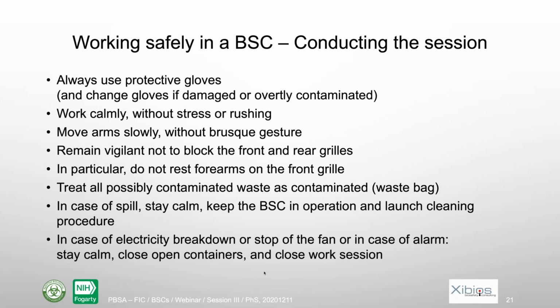Also, in case of spill, I mean, biosafety cabinets are there to protect us from aerosols during normal operation, but also in case of spill. So if there is a spill, the first thing to do is to keep the biosafety cabinet working. It should keep working. It's there to protect you in that case. And then stay calm, close your open tubes, and start your cleaning procedure.